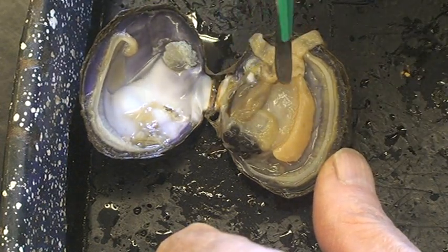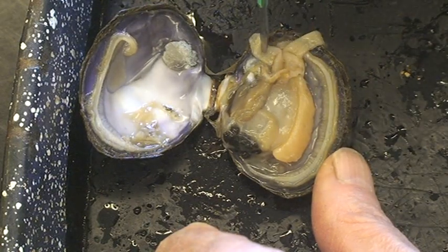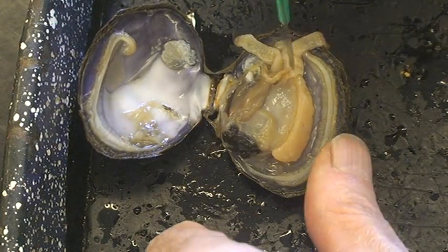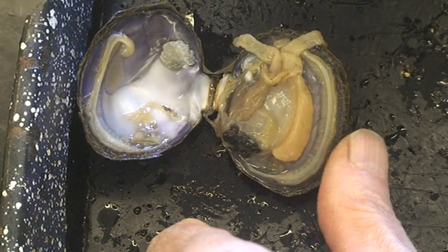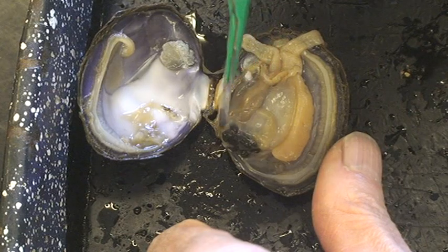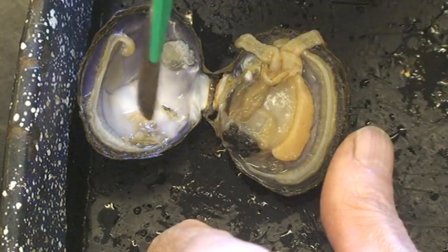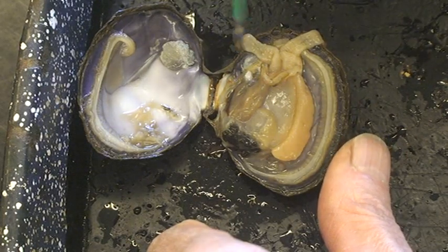Most of the rest of the body here, besides the mantle, the foot, and the incurrent and excurrent siphons, and the gills — the rest of this in here has the rest of the organs: the heart, the digestive system, the liver, the gonads, and things like that. They call that the visceral mass. The viscera is all your internal organs, and it's just kind of a mass there — all coiled around together inside.